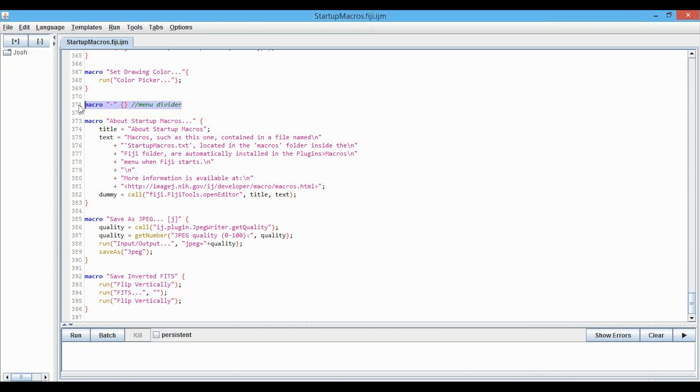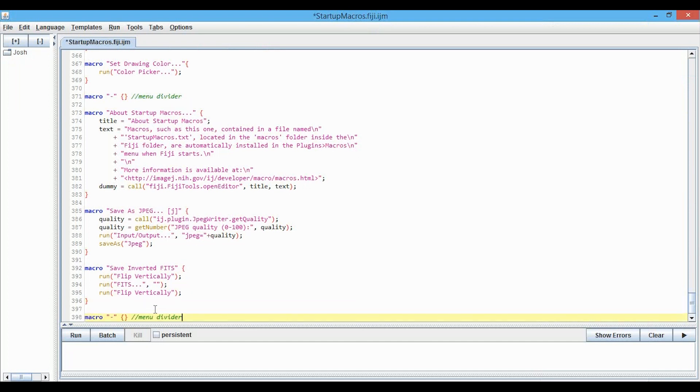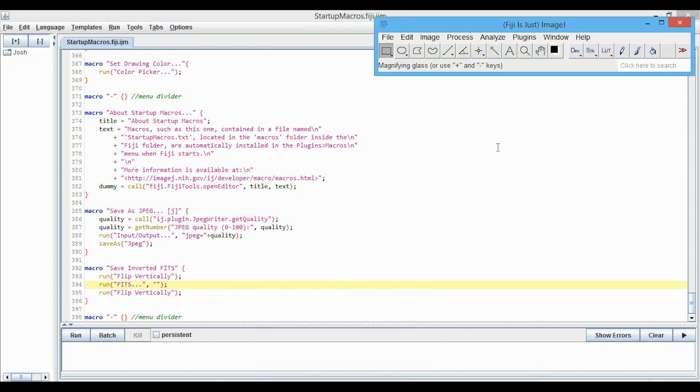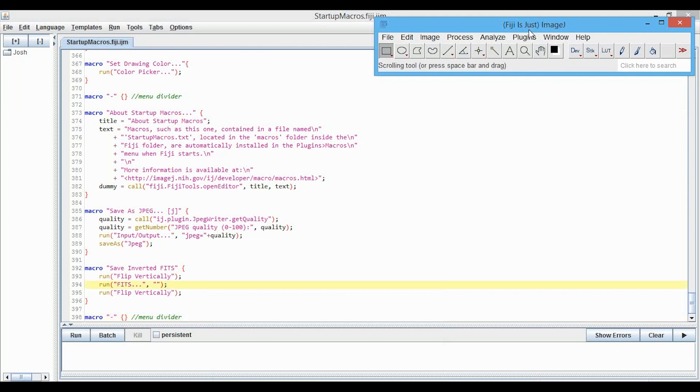So first, let's just copy and then paste that down here, and save it. We can actually install this, because this will open up in ImageJ. Every single time you open up ImageJ, it'll run this macro.